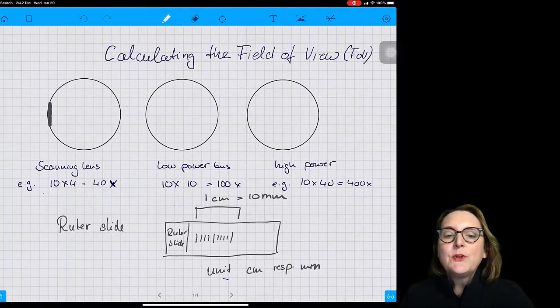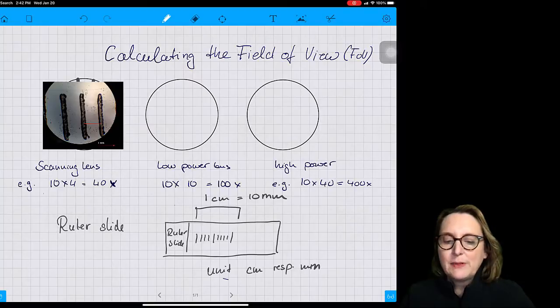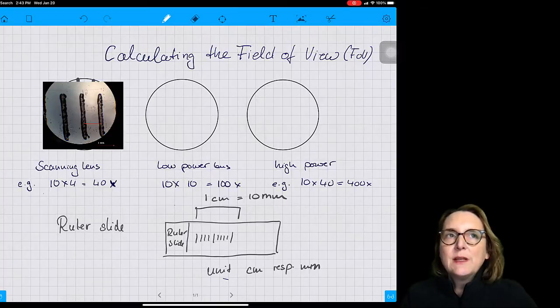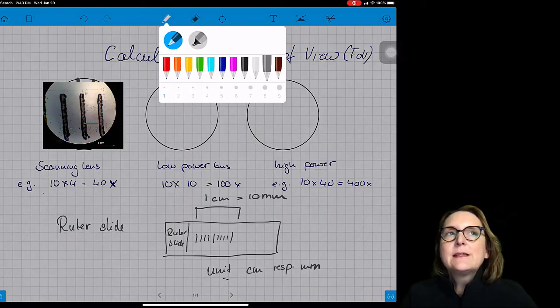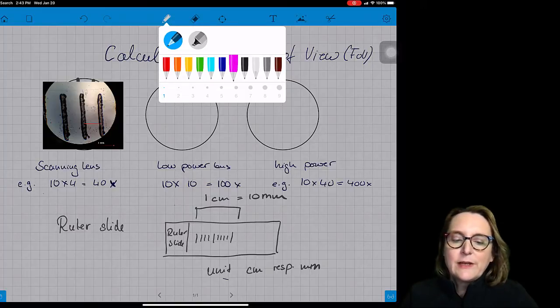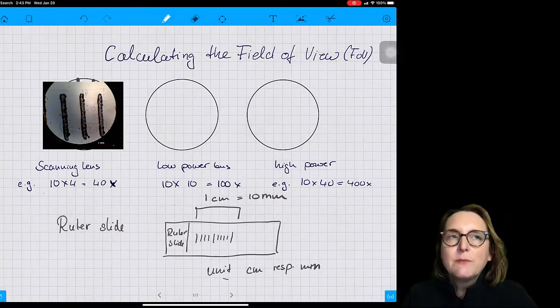We start with the smallest objective lens, which is the scanning lens. Here I used a ruler slide — a plain microscope slide with a piece of a ruler glued onto it, with units in millimeters and centimeters. So 10 millimeters make up one centimeter. This is an example of a true ruler slide, though when I did the calculation in lab I had slightly different results because I used a different microscope.